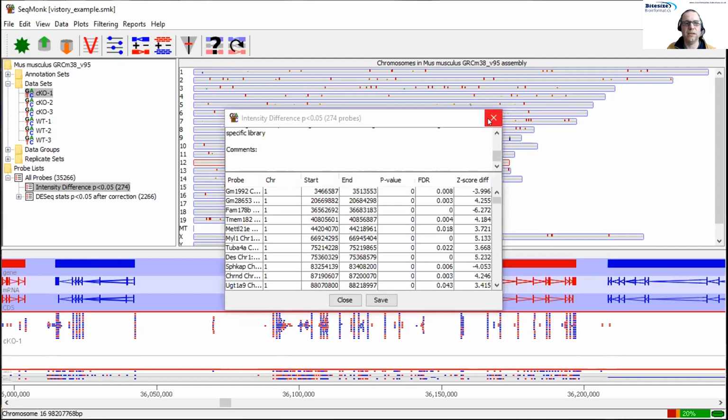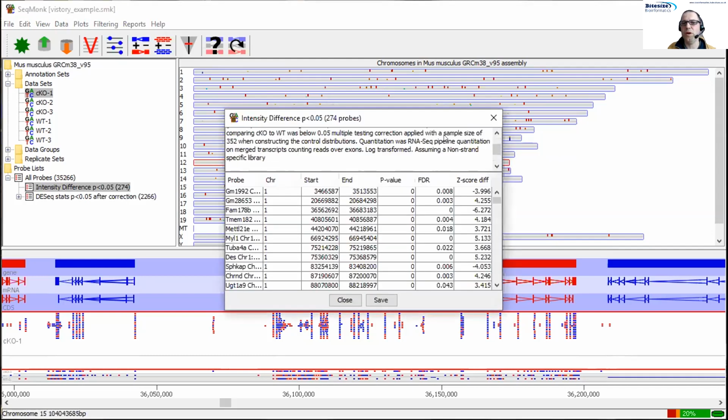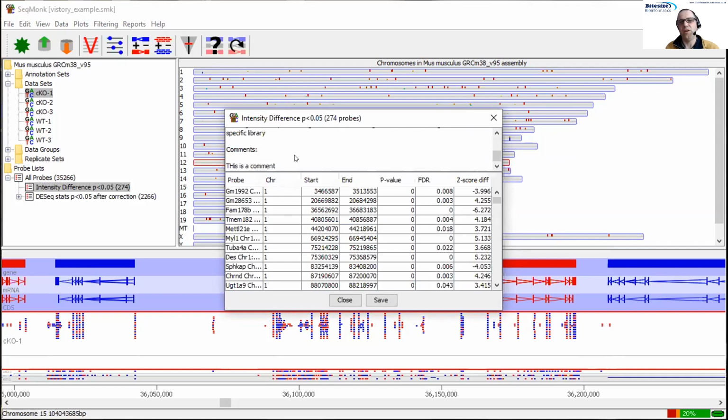It means that associated with that list will be the comments that you've put on, because we realized quite a long time ago that it's not enough just to describe what it was that you did. Really, the interpretation also requires you to be able to annotate, well, why did I do that? What was I aiming to do? What did I think of the results? So that commentary around your analysis is really important as well.